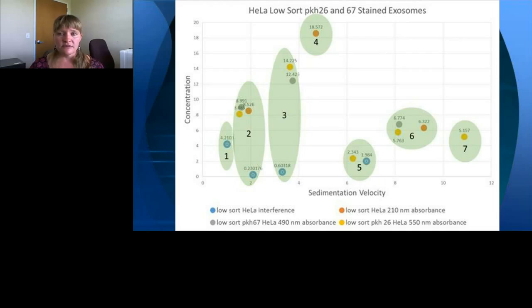As you can see from this particular location, we have several different groupings. For example, this one only has lipids, so you could think of that as perhaps a lipid contamination. Some are only dyes, which could be your dye aggregation. So it's telling you the concentration in your sample, what is extracellular vesicles, what is probably buffer, what is dye, what is lipid. Therefore you can use those to determine how your extracellular vesicle prep or method is working.